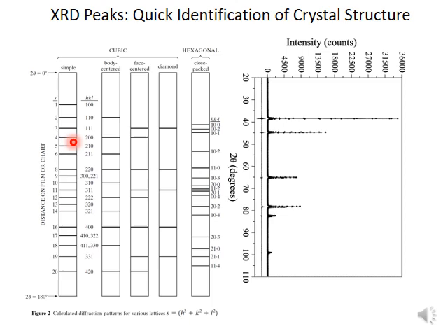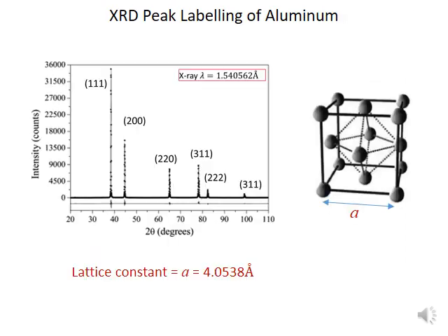So this kind of table is quite handy, and some people, if you have enough experience, just by looking at the spectrum, would immediately identify what crystal system it is.